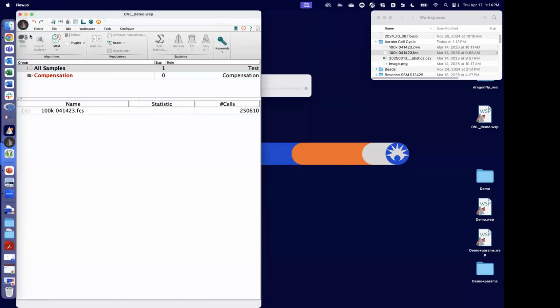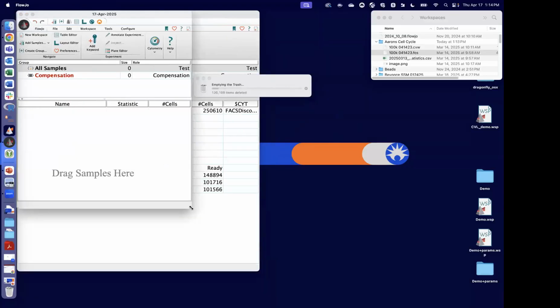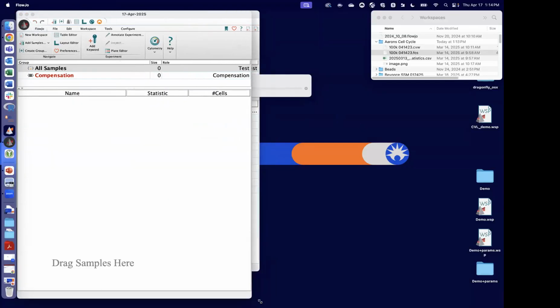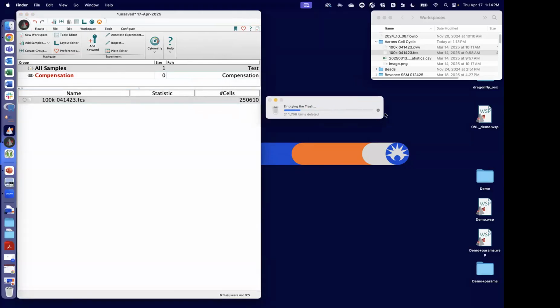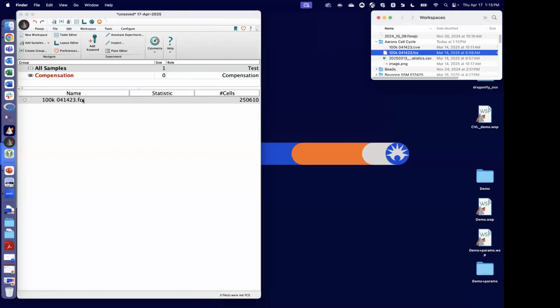Or let me start a new workspace and do that with the trash emptied. You can see that I did this earlier, so I've probably fouled up the first time that you extract the bin. All right, let's try that again.